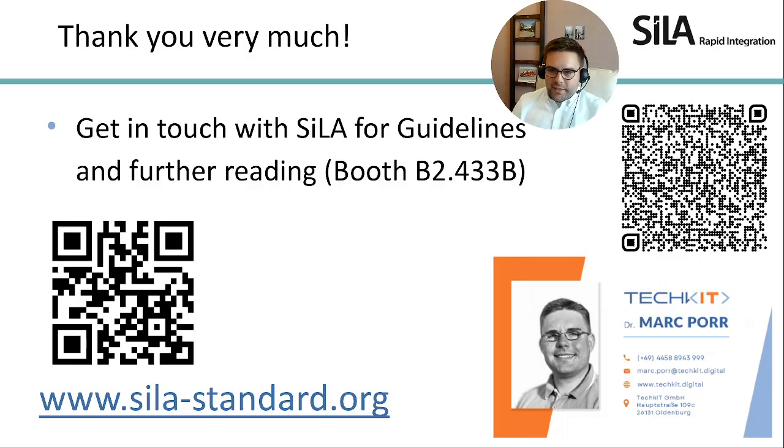It doesn't need to be a SiLA driver, because it's just generic checking for software. So if you're using a software stack that is similar to where we have a SiLA implementation for, you can simply use these templates, have a look at that, and we will also release a guidelines document about what you need to think about when doing automation.